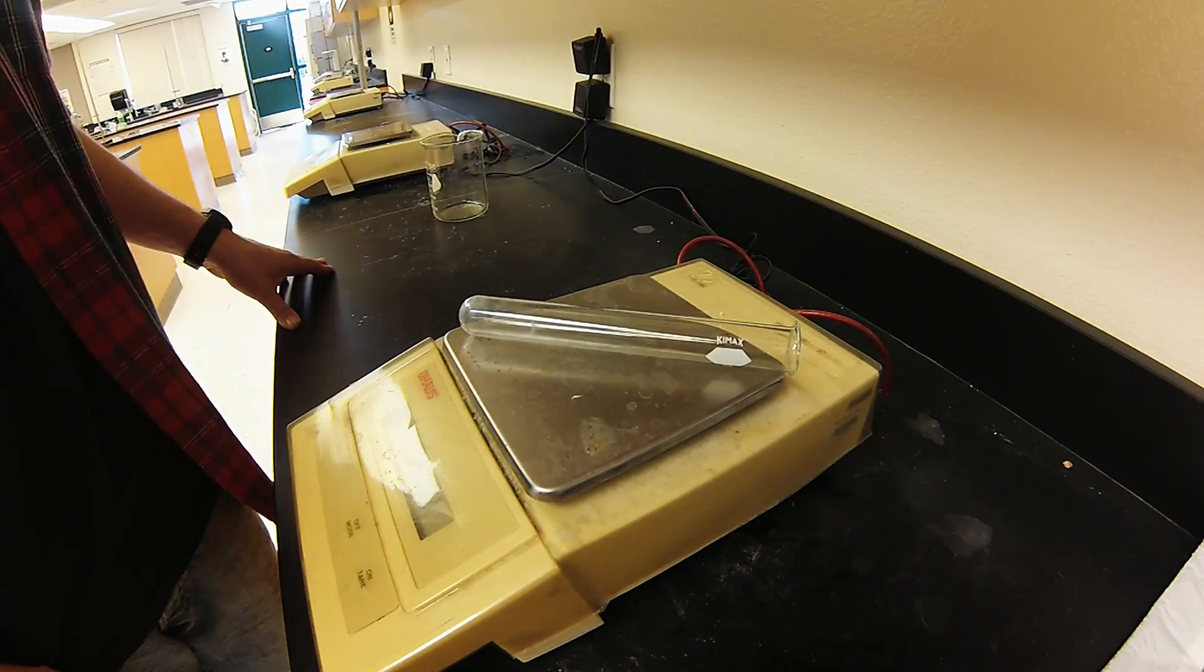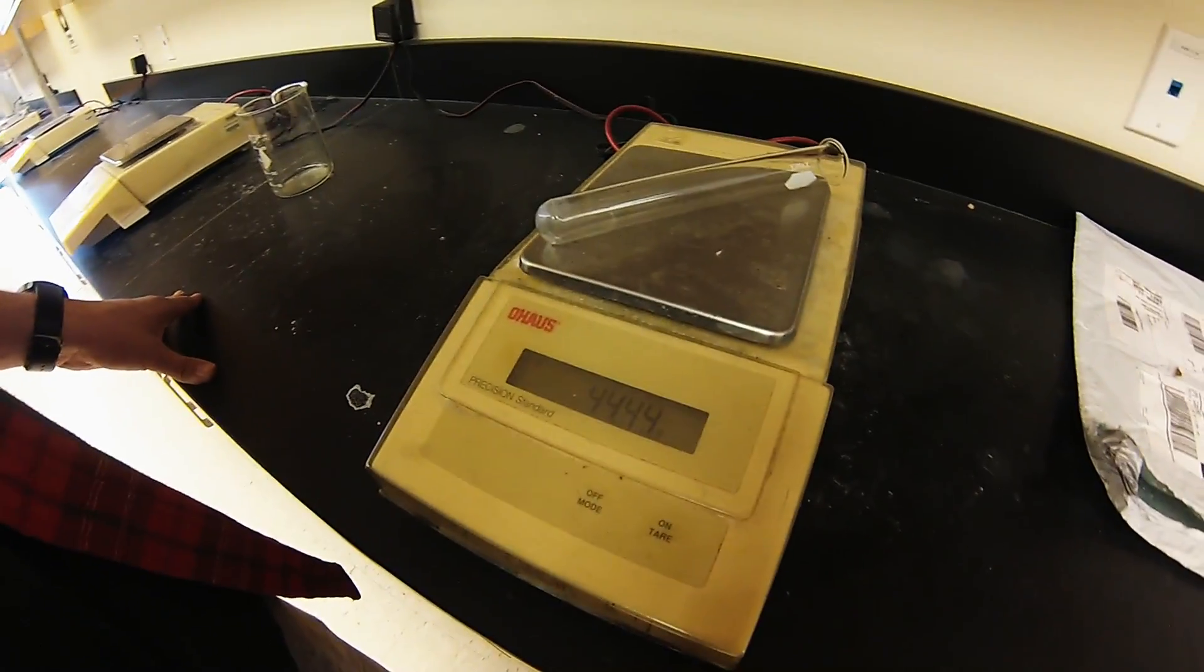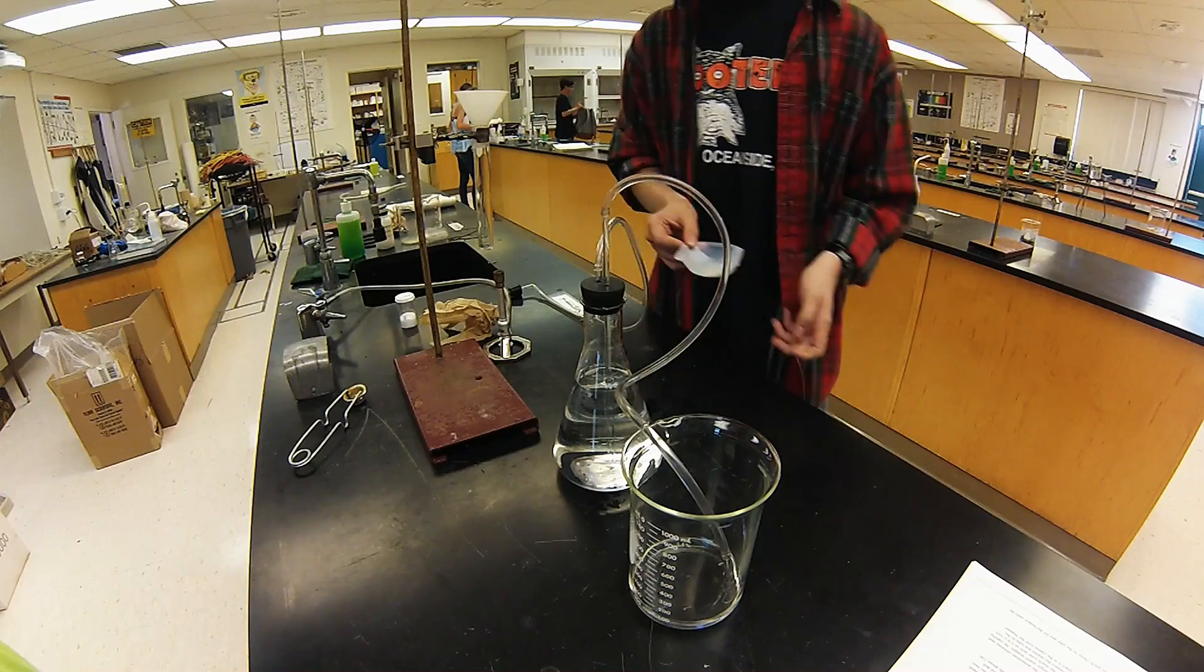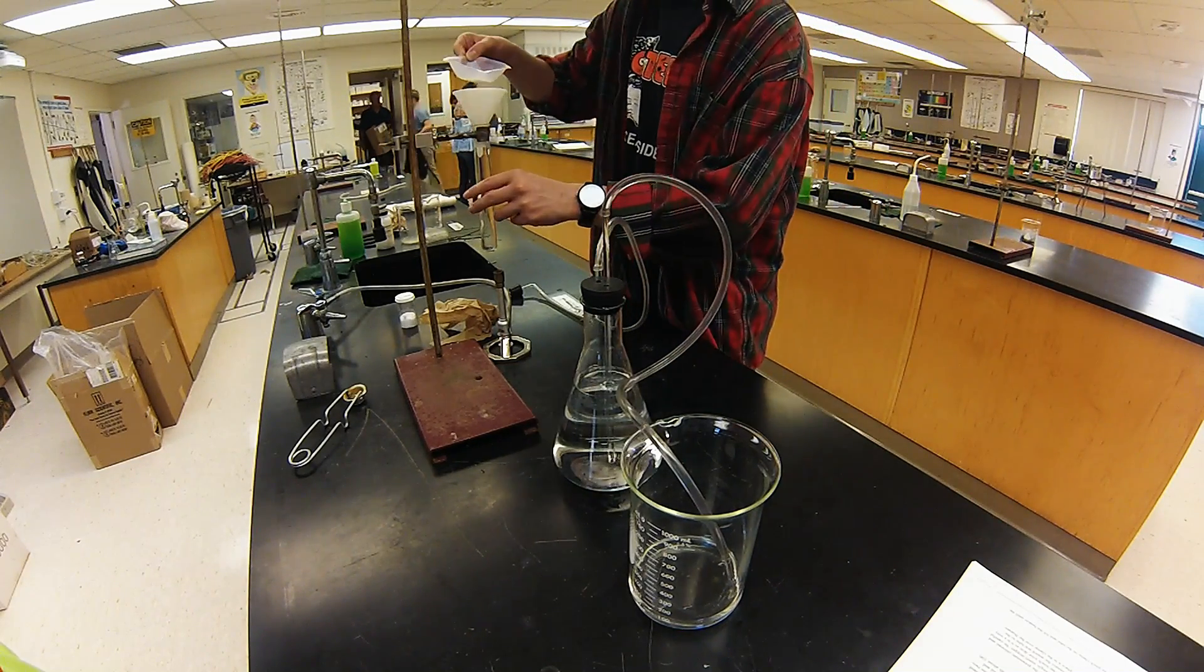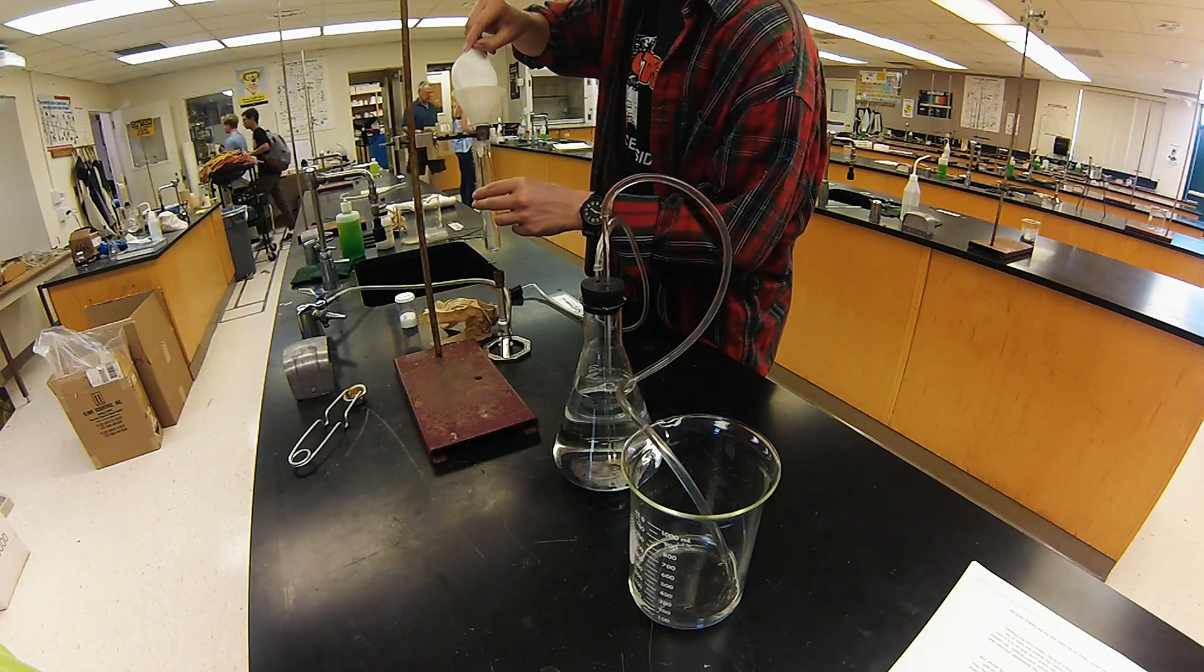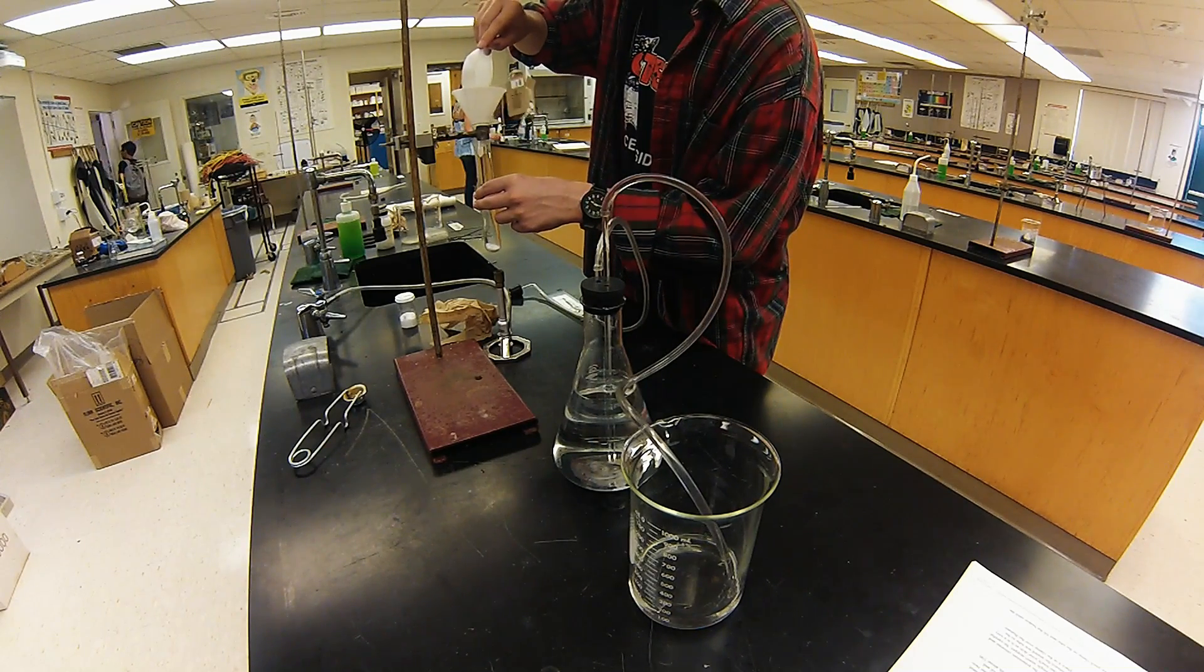Make sure your scale is zeroed and weigh it out. I'm getting the two grams of potassium chlorate that we weighed out and pouring it into our test tube using a funnel so I don't burn my skin.